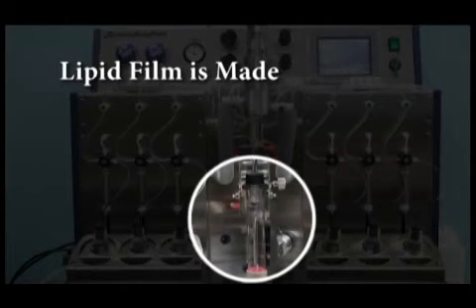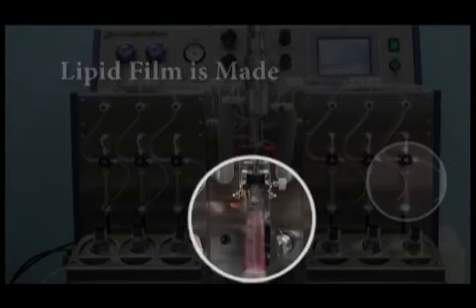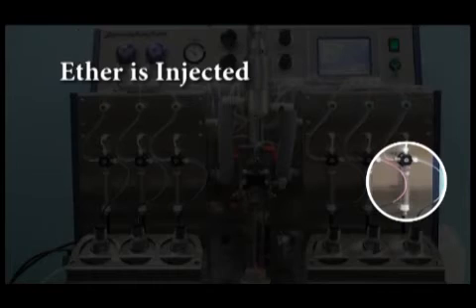The system then makes a lipid film on the wall of the test tube by vortexing under the appropriate temperature and reduced pressure. Ether is then injected into the test tube and dissolves the lipid film by vortexing under the appropriate temperature.